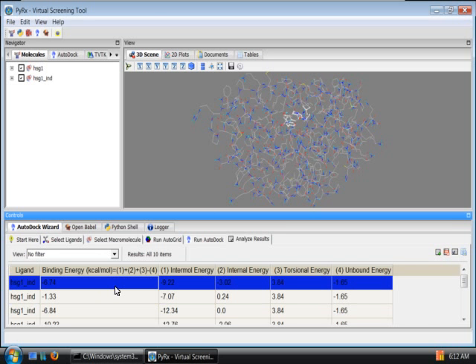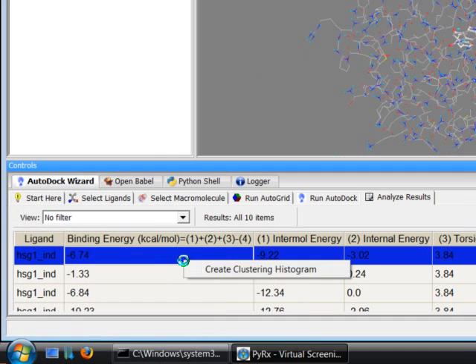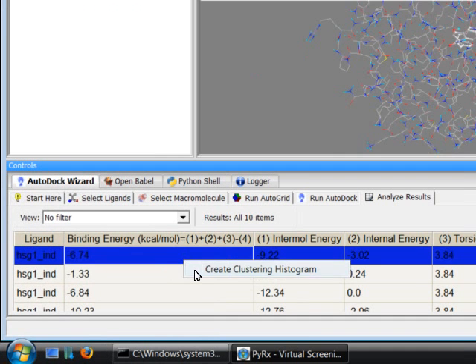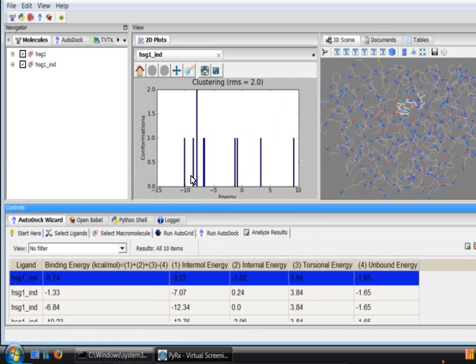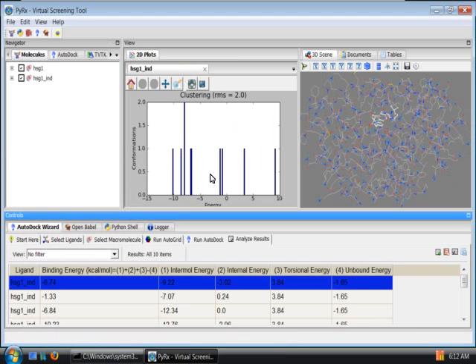Right click on any of this row and select Create Clustering Histogram. This will create this histogram where you can see on the x-axis the energy and on the y-axis the conformation.